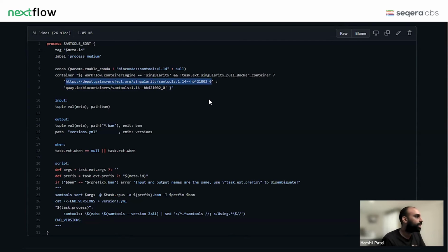But then you've got your standard fields, like Evan has gone through. You've got some sort of input, which in this case is a BAM file, and you've got an output, which is also from SAMtools sort, it would be a BAM file as well. And in order to keep these as flexible as possible, we've got some options that allow us to configure the command line options to, say, SAMtools sort coming from a configuration file. And this really allows developers to use a vanilla version of SAMtools sort, or to add their own arguments and really customize the behavior of the module.